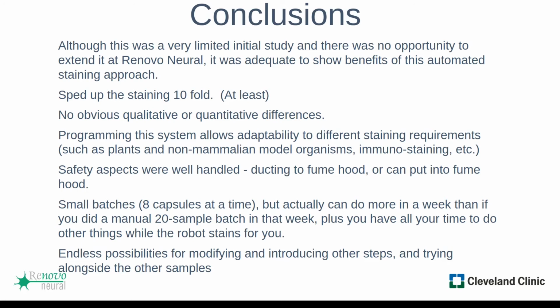And on a less serious note, I'm just being a little bit silly, but it's kind of important. The ASP1000's text and email capabilities can be used to boost your employees' morale. It would text me to tell me what to do or give me an update of where it was up to, or I would have it text me to tell me that it's going to soon be at the TCH step, so I would make sure I have it all finished being made. When it gets to that step, it sends me another text and tells me I have to put the TCH in. Well, I didn't really want to be told what to do by a robot, so I would have it sign its texts with love, ASP1000, or other kind messages.